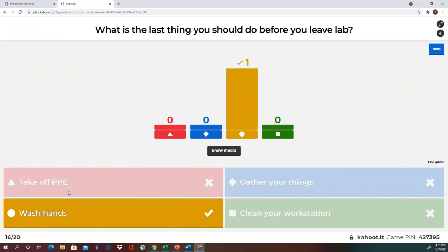And if you have hair that's longer than about shoulder length, give or take, then you want to always pull it back, no dangly jewelry of any kind, and closed foot shoes. Okay, so we now say closed foot shoes because closed-toed, turns out, wasn't detailed enough, because we want the tops of your feet covered as well, right? Because if you spill E. coli, if it gets onto the top of your skin, right, no good. Not the end of the world, but we'd like to avoid it.